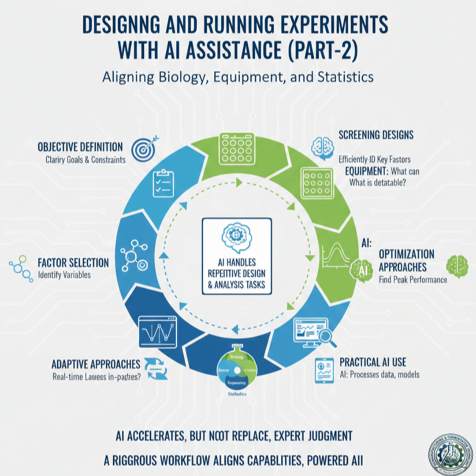So this is where the human expertise acts as the boundary condition, the guardrails. You have to look at the plan and just say, no, AI, we are not doing pH 9 today. It's a risk assessment. The notes explicitly say you have to ask yourself, what could crash the culture? That is your hard limit. Because you can't learn anything from a dead tank. Nothing. The math assumes you get a result, even a bad one. Biology doesn't guarantee a result at all.